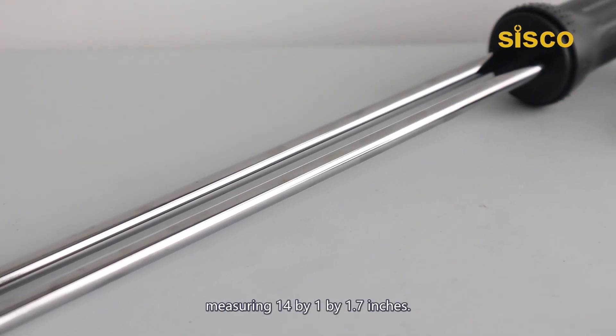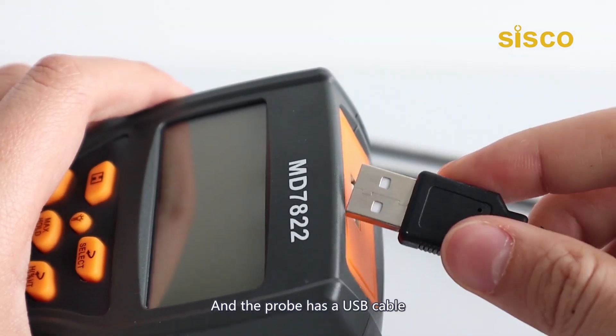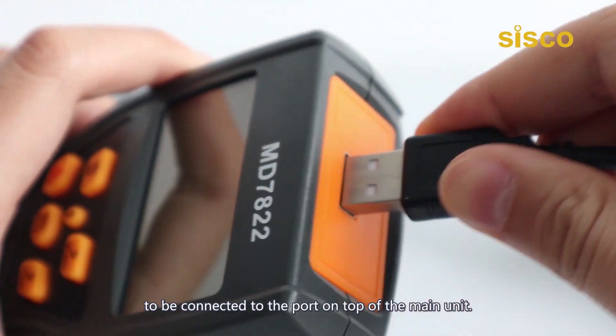The probe adopts a dual prong design for rapid reading, measuring 14 by 1 by 1.7 inches, and has a USB cable to be connected to the port on top of the main unit.